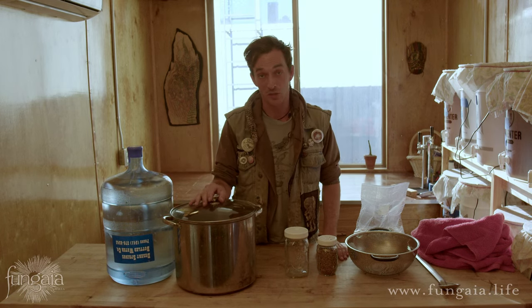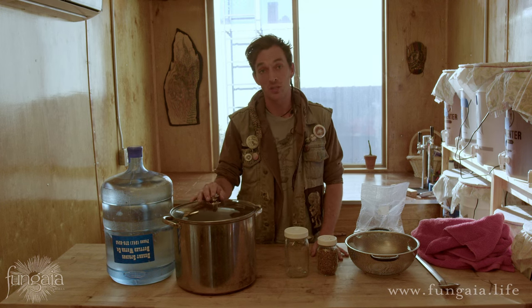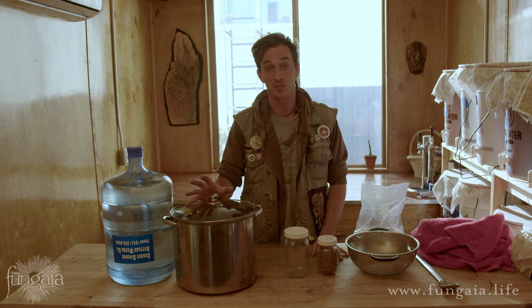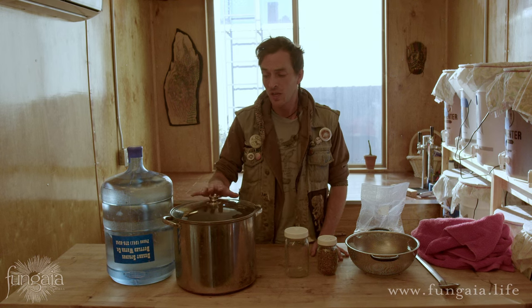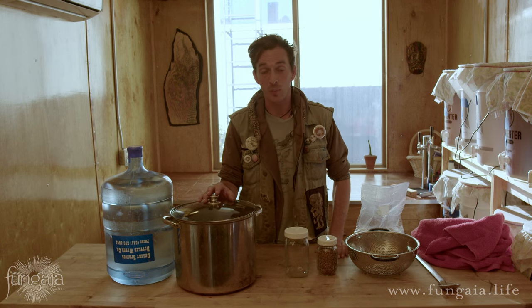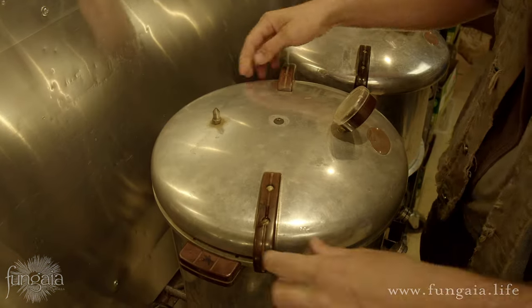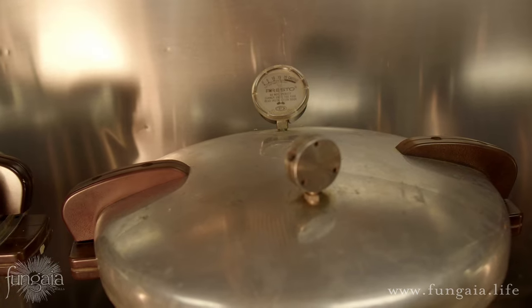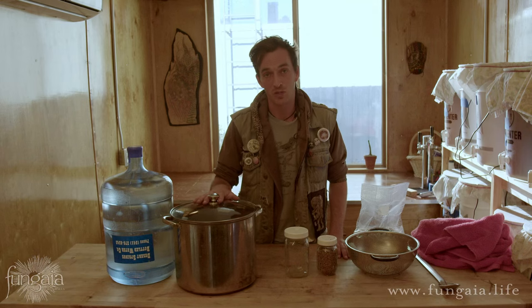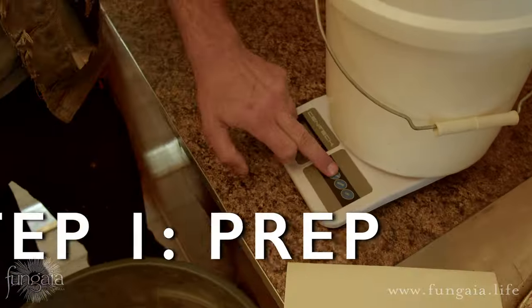The other thing you're going to need is a pressure cooker or a vessel to sterilize your grain in. There is a technique for doing this without a pressure cooker — it's called tindalization or fractional pasteurization, and I'll make a video about that in the future. Most people start out with either an Instant Pot or a cheap Presto canner. I personally am a big fan of my antique Presto 21s. I do a deep dive into sterilization systems and methods in one of my mushroom cultivation basics videos.